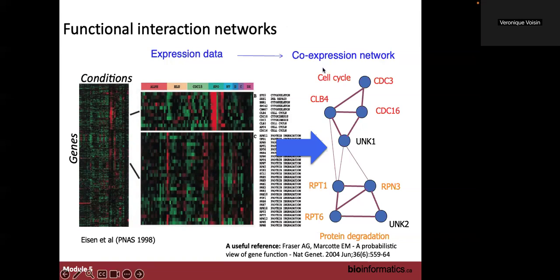We can see that the edges have different widths. It represents the weight. The width of the edge represents the strength of the correlation, and we give more weight to a pair of genes with strong correlation.